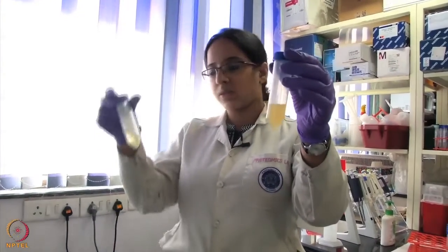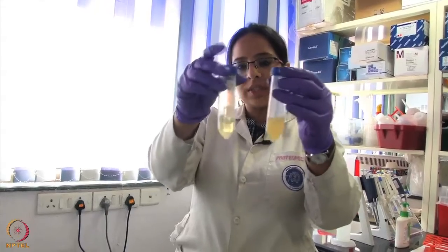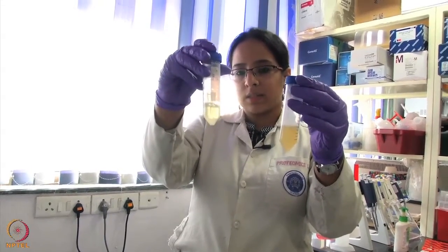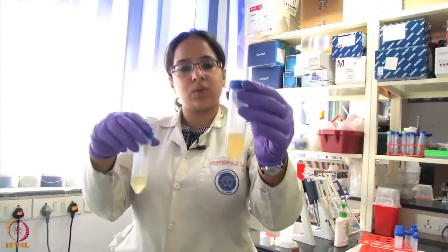So this is how a bacterial culture looks like. You can see it is very turbid, which is a sign that the bacteria has grown properly overnight. And this is a tube which we have just kept for the overnight incubation. You can see the color of this tube. It's not turbid, it is transparent, but after the growth this is how it looks like.